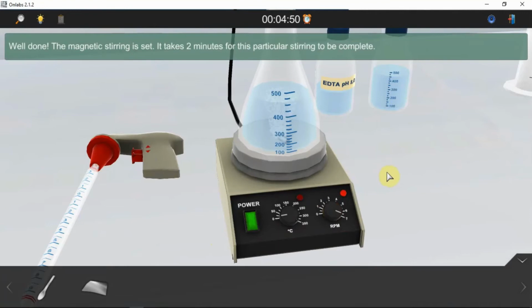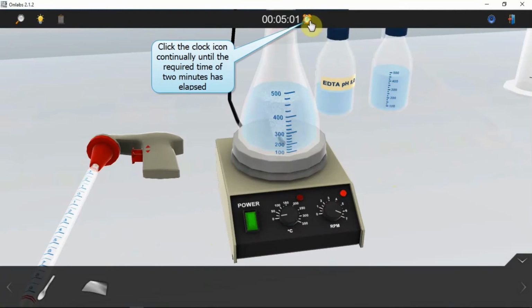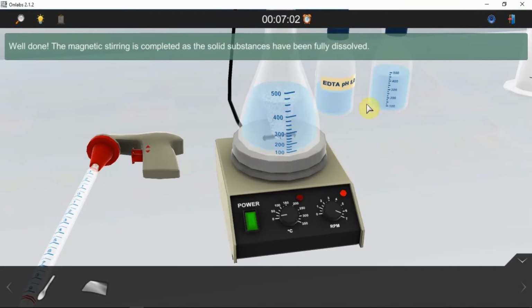Well done. The magnetic stirring is set. It takes 2 minutes for this particular stirring to be complete. Wait for the magnetic stirring process to be over. Well done. The magnetic stirring is completed as the solid substances have been fully dissolved.